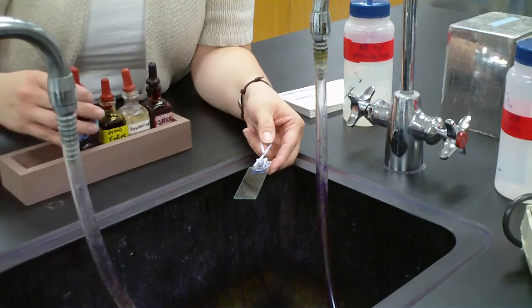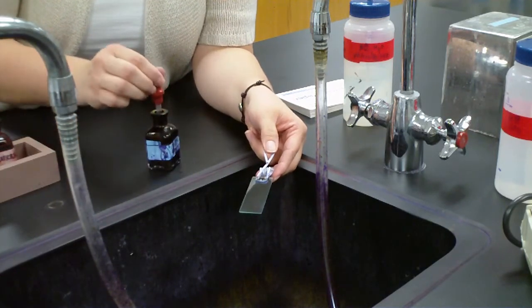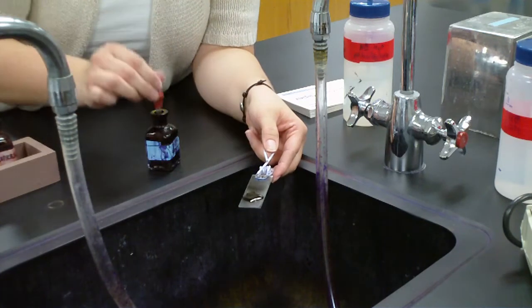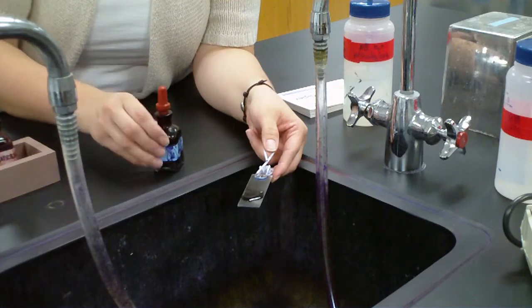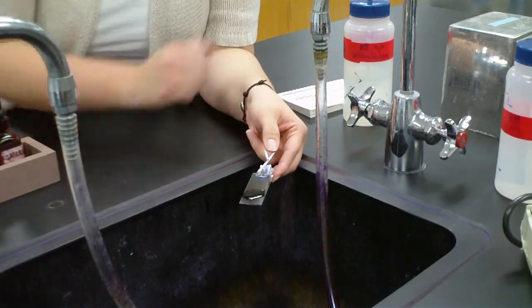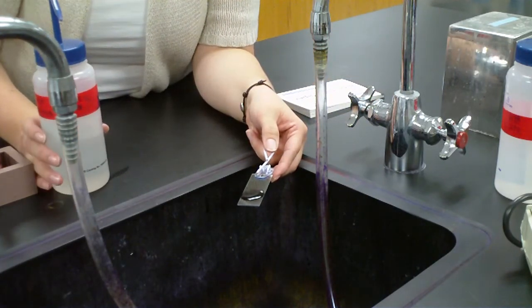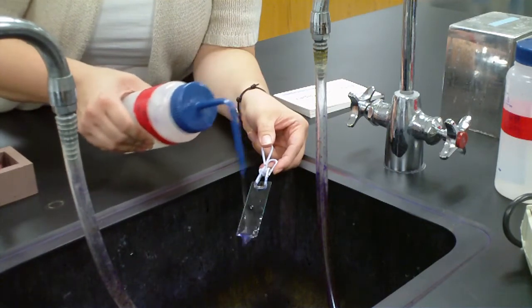So my first step is my crystal violet. And so I take my crystal violet, hold my slide over the sink, and I'm going to flood my smear with crystal violet. So I'm going to hold this on here for 1 minute and let the color seep into the cell wall of my bacteria. So let's pretend a minute has passed by. I go ahead and rinse that off with water. Okay, rinse off the excess.